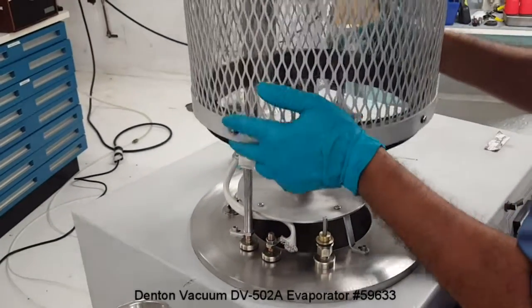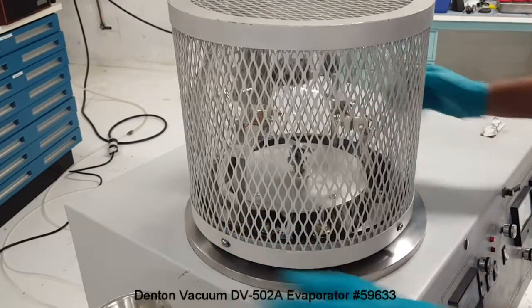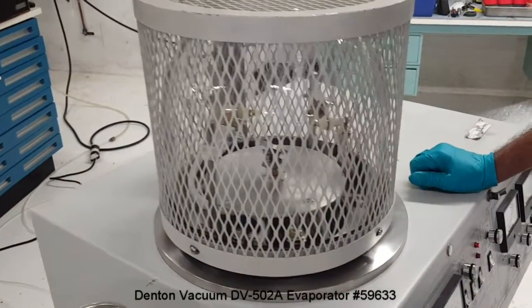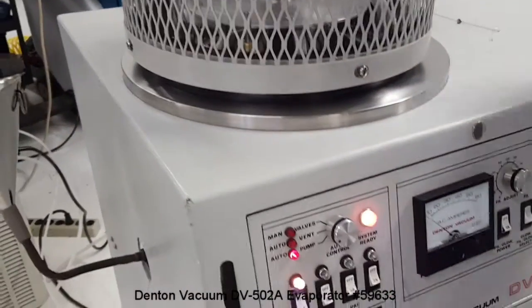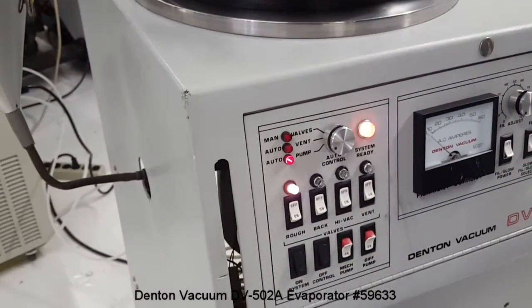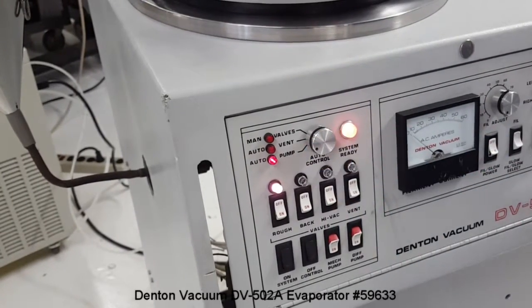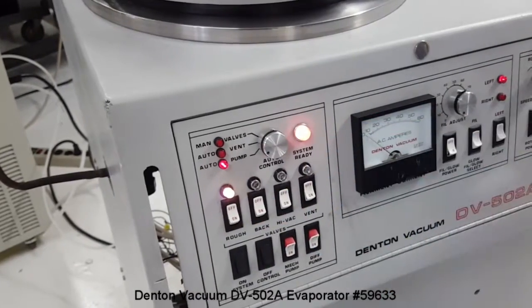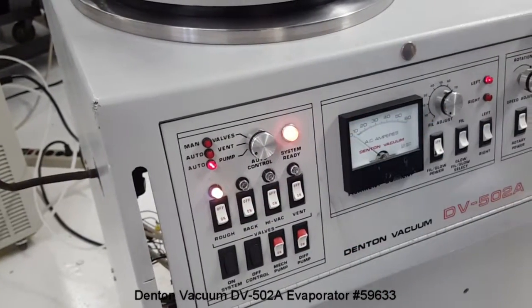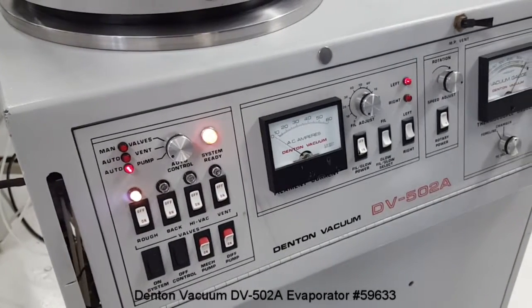After loading the sample and material to be deposited, we have to start the pumping cycle by rotating the knob to auto-pump. Right now the roughing valve is open and the backing valve is closed, and the chamber has started to pump down.